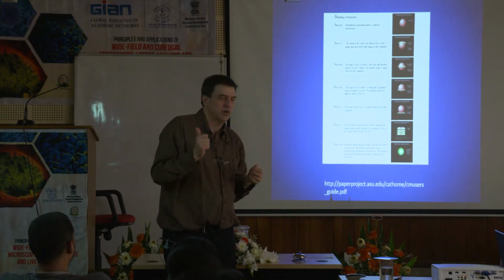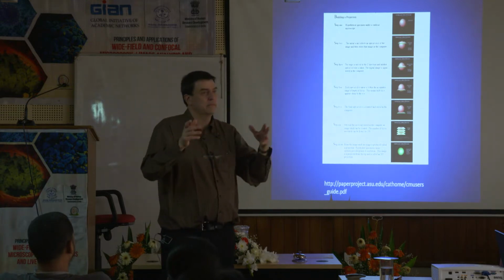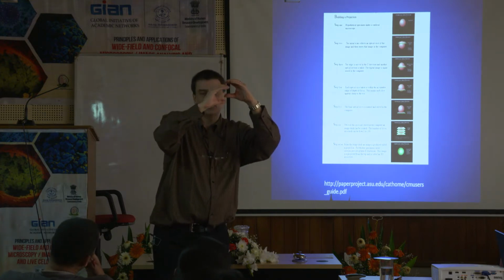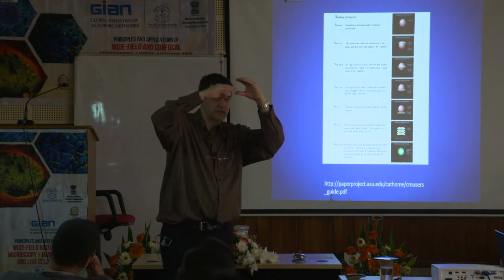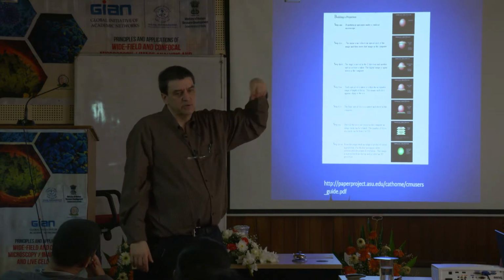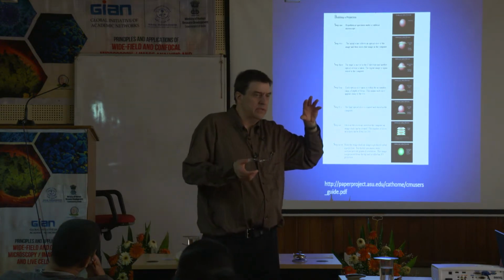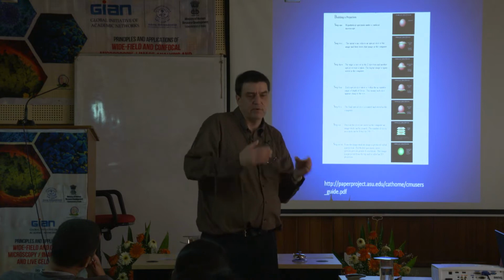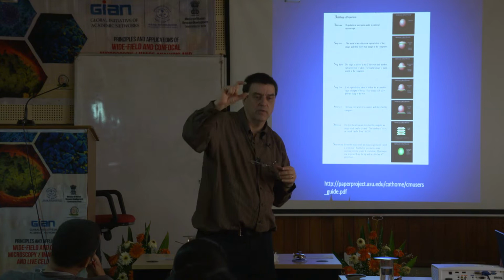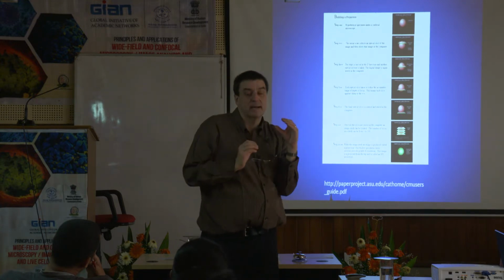So the nice thing about these confocals, the way they're designed, is there are big physical formulas, big math formulas, to determine how much overlap I should have and how far I should move in microns to get that overlap. When you use a certain objective and tell it what wavelength you're going to use, it'll automatically calculate that for you, and it will give you the appropriate step size. That moving from one plane to the next plane to the next plane is called step size.